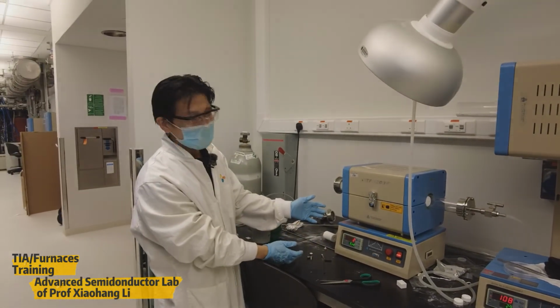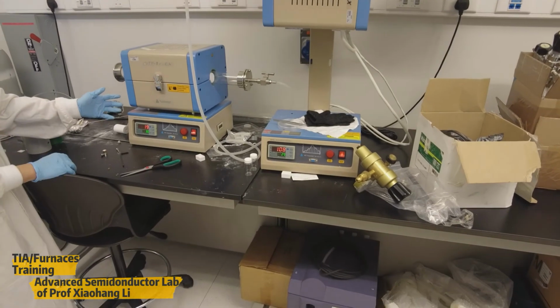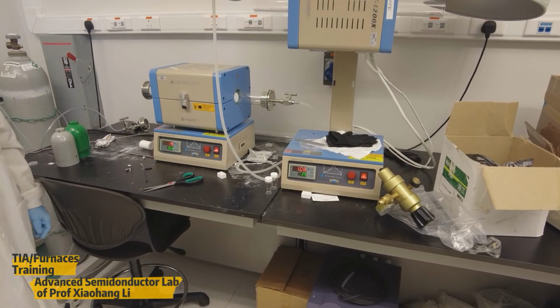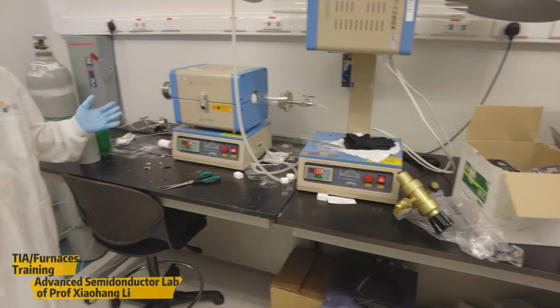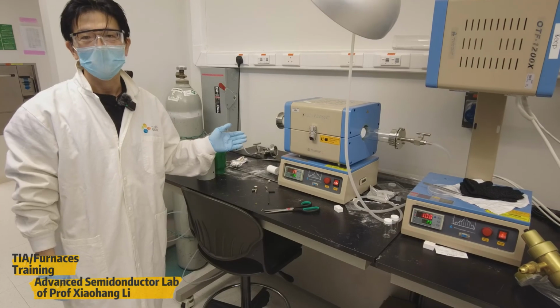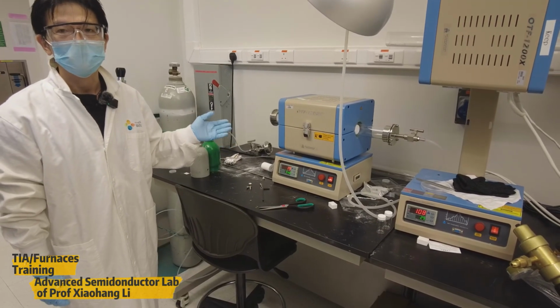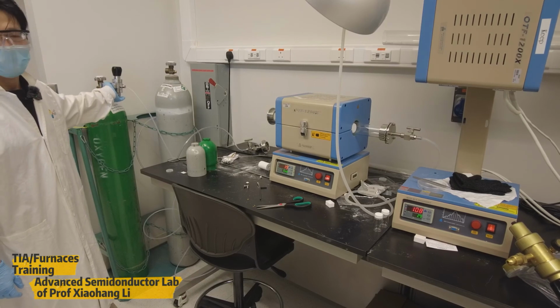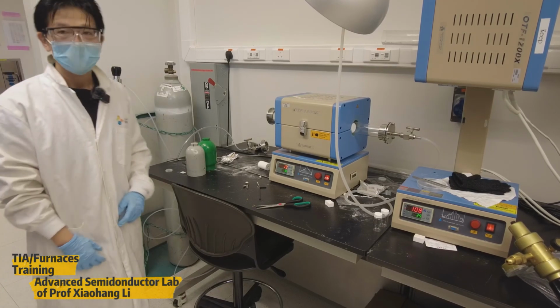Set the program as we have done previously, and run with the tube furnace. This will let your sample anneal in the gas ambient as you wish, as long as you flow the gases you want. Okay, that's all.